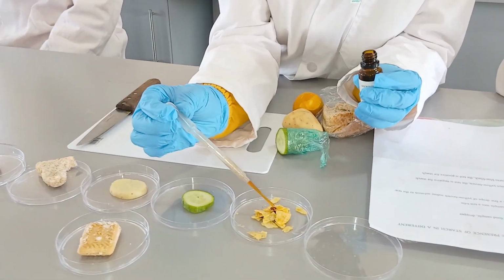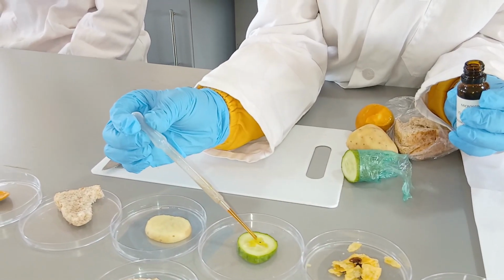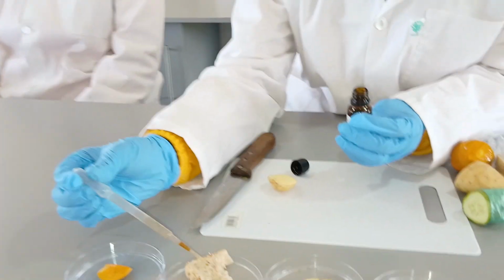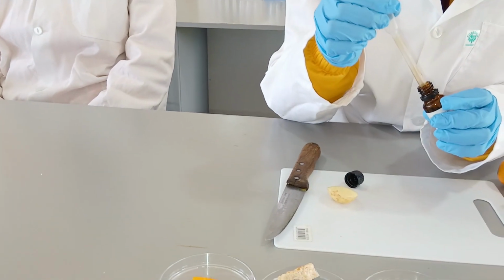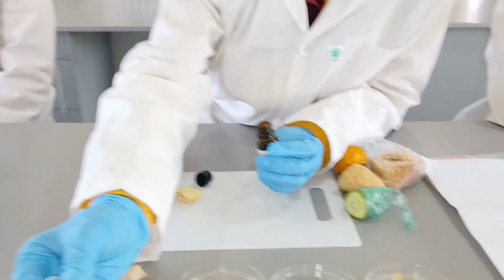This is the well-cooked potato. This is a cucumber, 2 drops. This is a potato that is not cooked. This is brown bread. And this is a mango. And this is a biscuit.